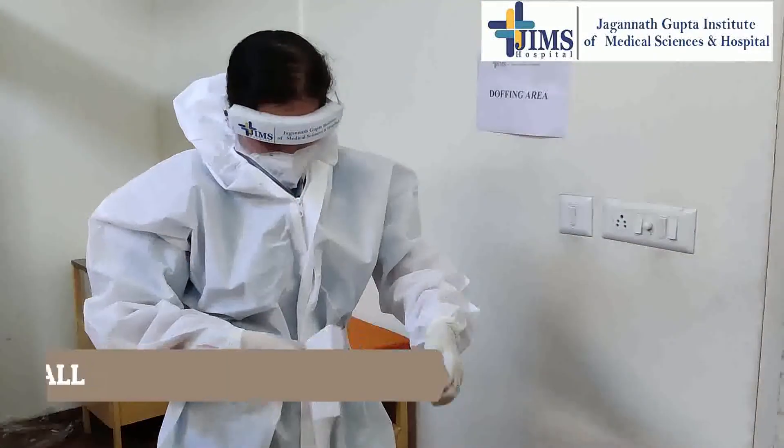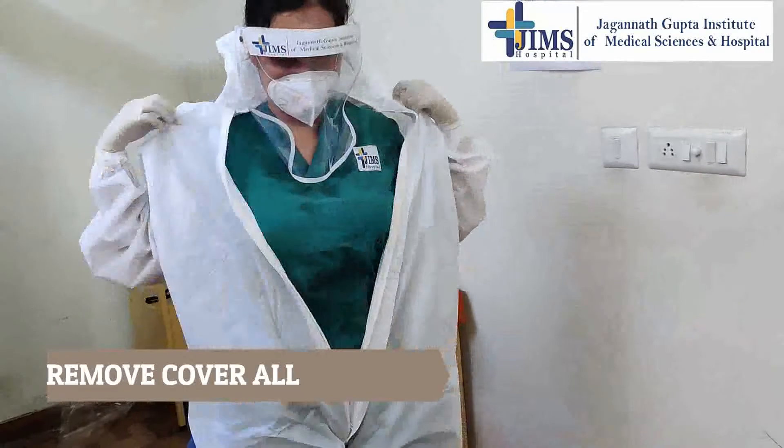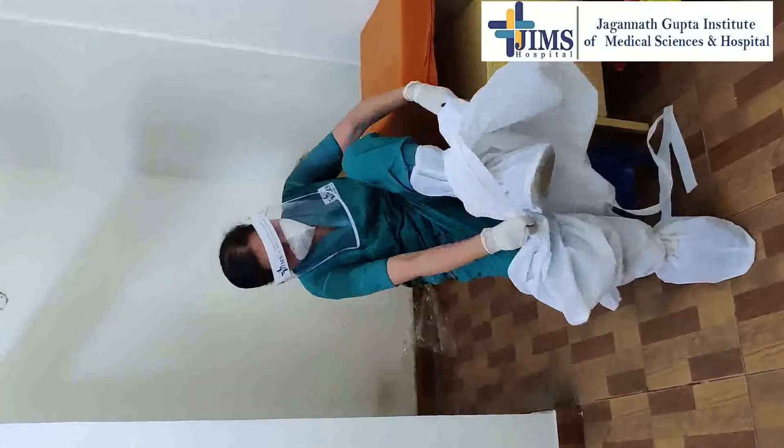Remove your protective clothing without touching the inside of the protective clothing. Work from top to bottom, and avoid skin contact with the outer side of PPE, as the outer side of PPE is contaminated.